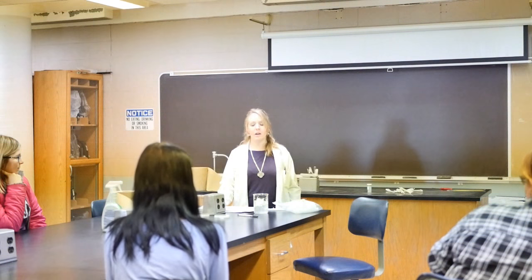So I will let you guys get your lab coats on, get some gloves on, and we'll go through with instructions. We'll get the lab set up, and we'll go through it. This should take the full hour. There's a little bit of an incubation period in the middle. We have to wait for like 20 minutes in an ice bath, and then we'll kind of walk through what's going on at each step too.